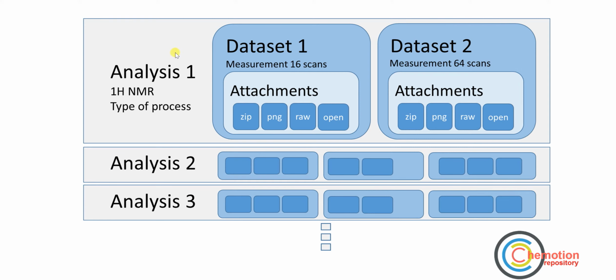You can add as many analyses as necessary for the identification of a molecule, and each analysis has as many datasets as available. In addition, each dataset then can be proven by as many files that you may provide.